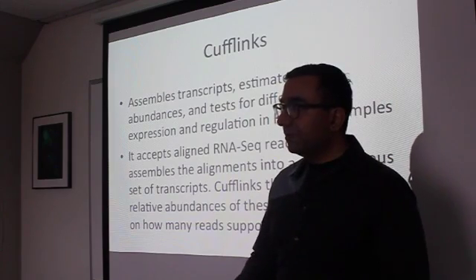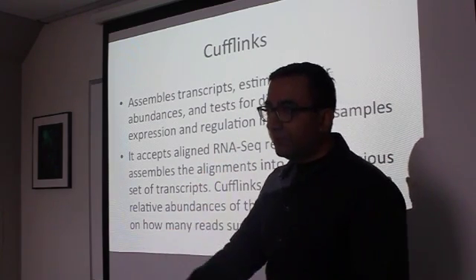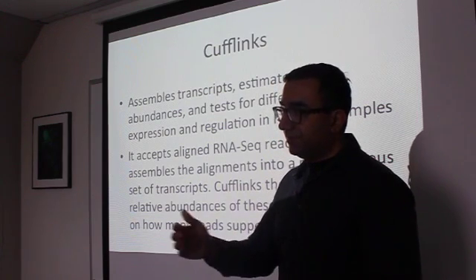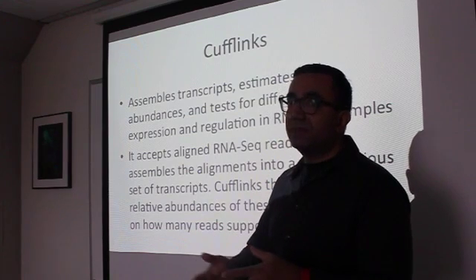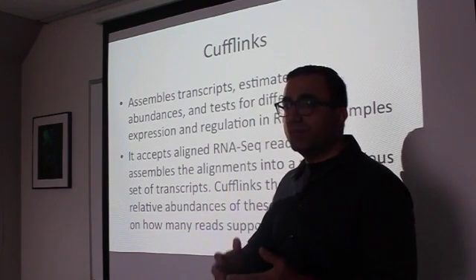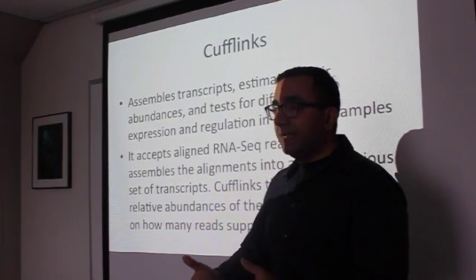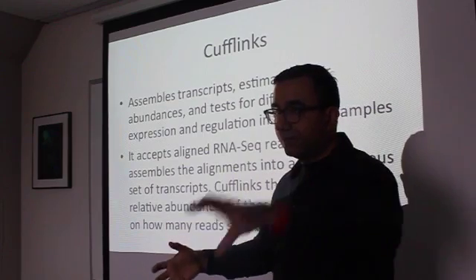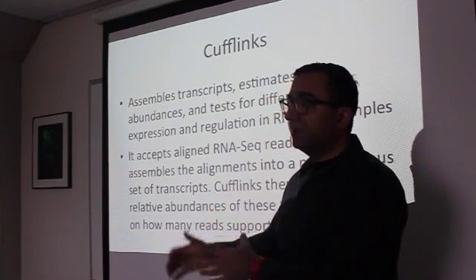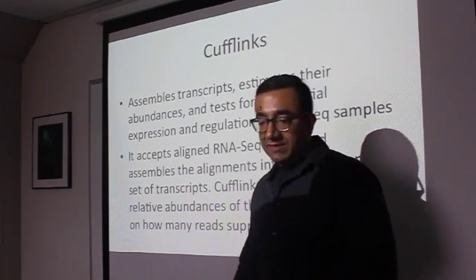Going to the next step, once we align it, we'll go over counting your reads. Once we understand the file formats, so once we understand what SAMtools and BEDtools are, then we go over counting your reads, and that's when we start R. It's going to flow straight into R, and you'll then do your differential expression analysis. So that's where we're headed.